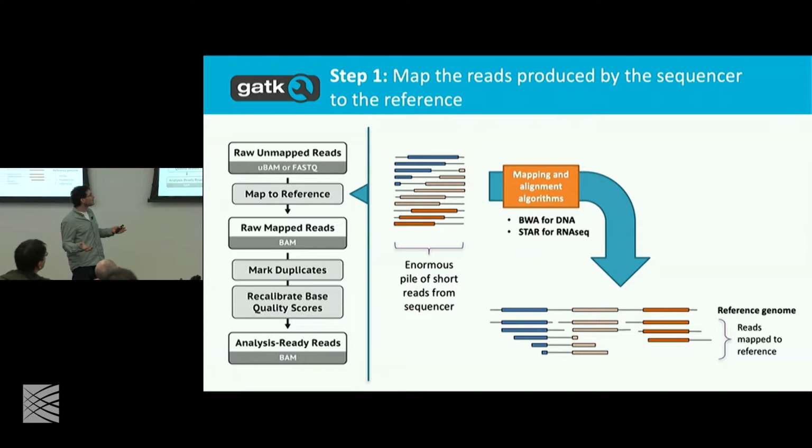So first thing is align. Basically, an alignment is looking at each read or each read pair, and finding the best place in the reference where that read fits. And not only where it fits, but specifically how it fits. If there are specific insertions or deletions, some alignment information that needs to be adjusted between the read and the reference locally, the alignment does that as well.